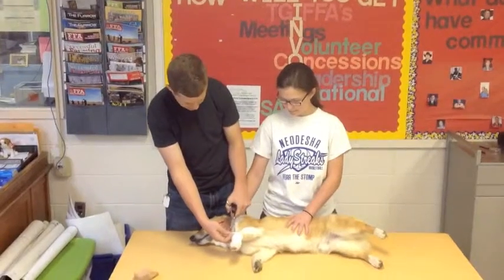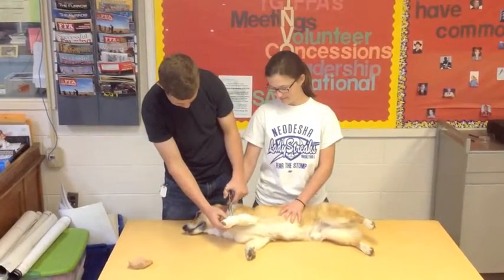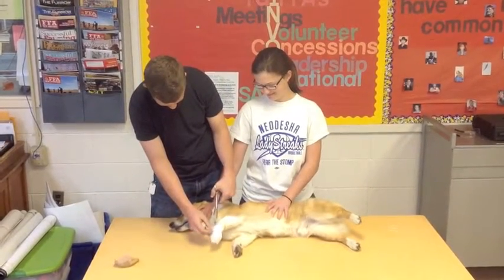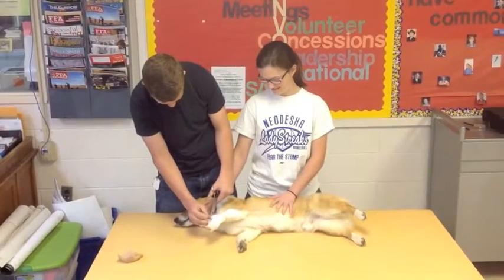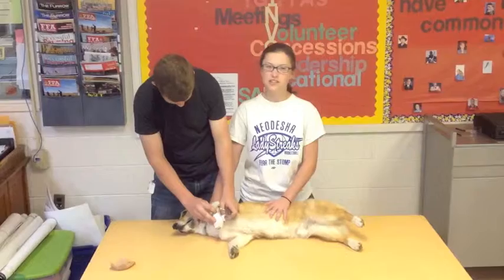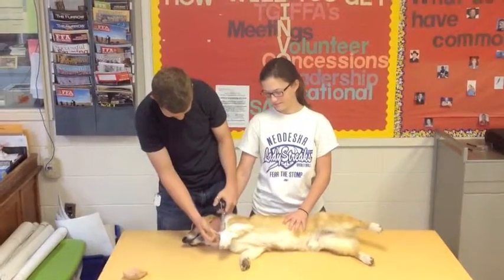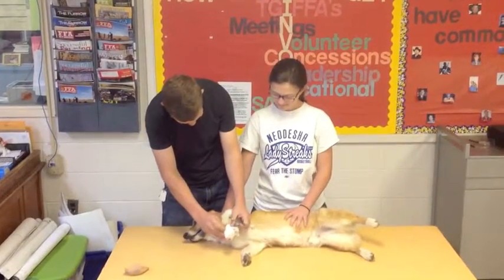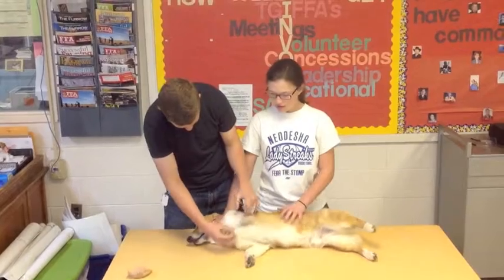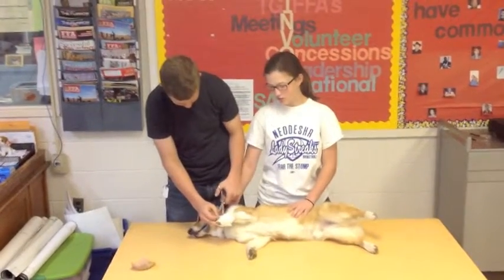Lift up the second layer and start cutting. Another way to phrase the way of cutting is the proximal end to the distal end. This side would be proximal and this would be distal. When you're cutting, make sure you use small incision-like cuts. Don't cut big chunks at one time.